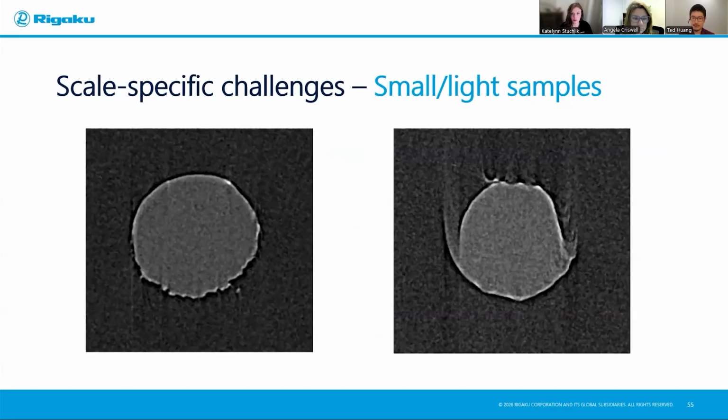Specifically, let's look at one of those, the more distorted one. To put them side by side, on the left is what it's supposed to look like. On the right is the non-ideal version of the scan. So what happened here? The left picture is from a sample scan that is very still, where your sample is not moving. On the right, what happened was during the scan, your sample moved.